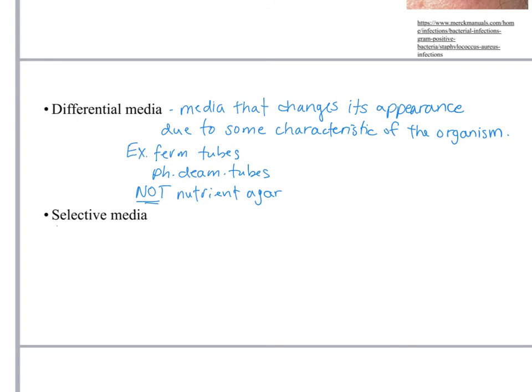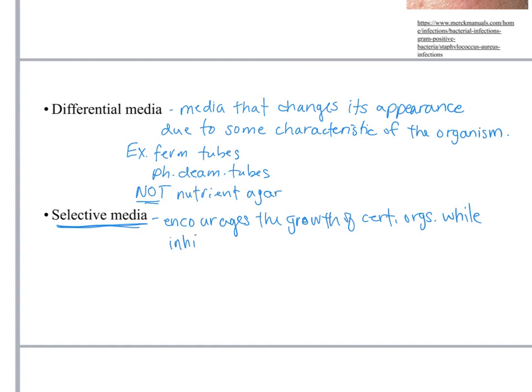Today, you're going to work with your first selective media. Okay, selective media has been enriched with ingredients in order to encourage the growth of certain organisms while inhibiting the growth of others.